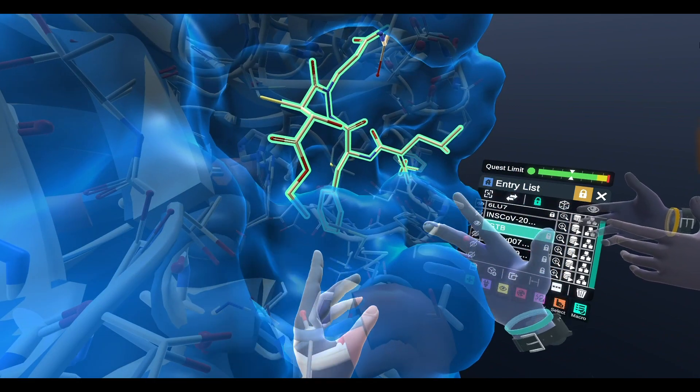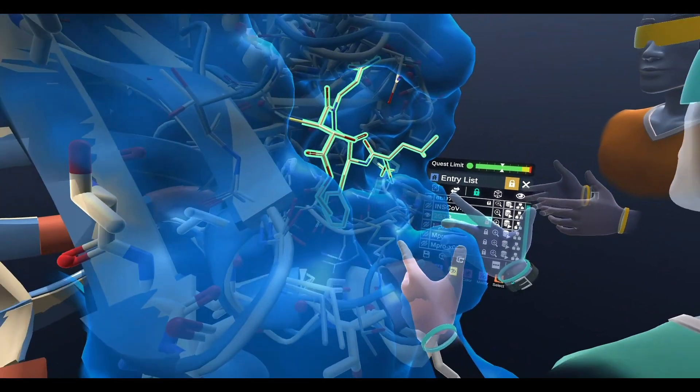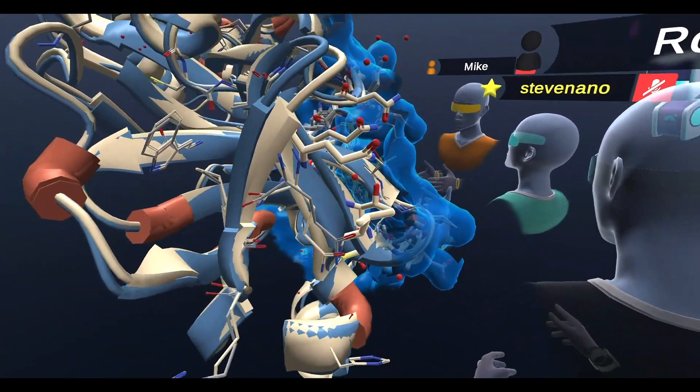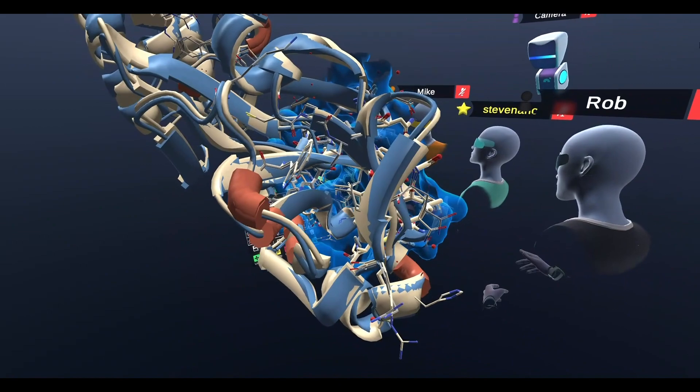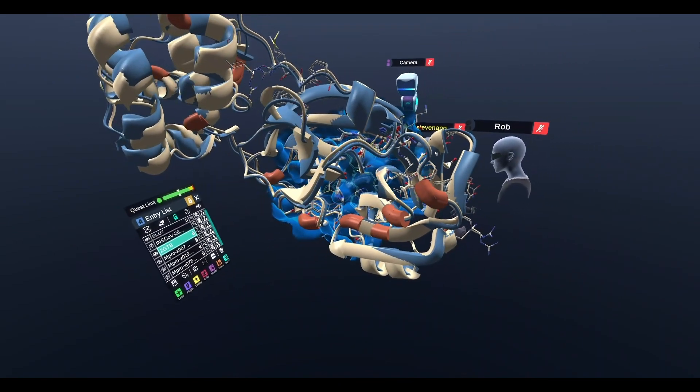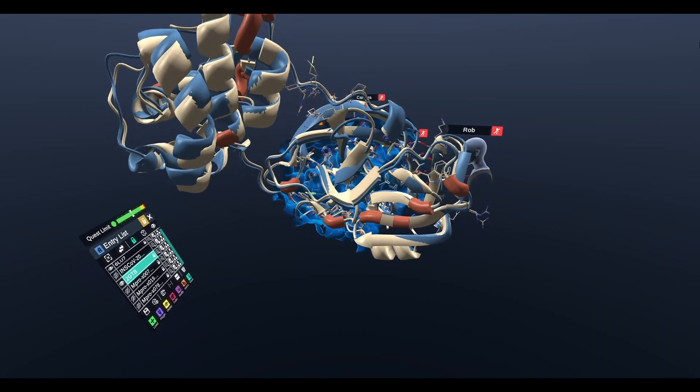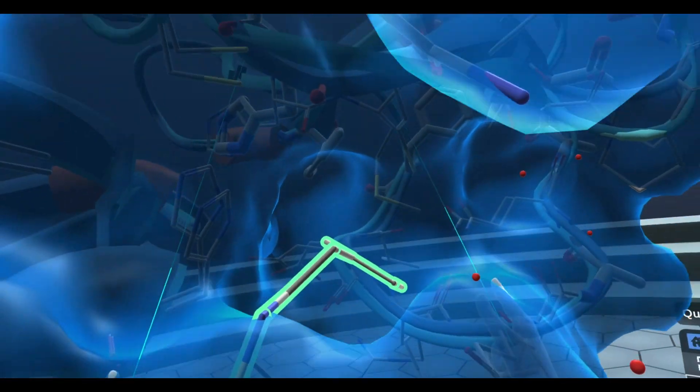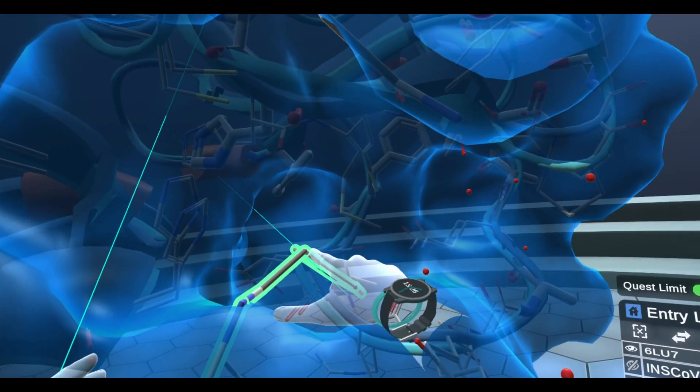And have new ideas come forward, because as you said, they're 96% similar. So almost no difference in the important region. Some of the interesting work that we've seen is actually around a fragment-based screening, and so I'm just gonna turn on another structure here.